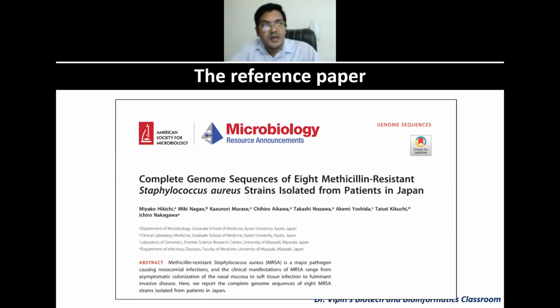All of you need to create an account in usegalaxy.org for the analysis. Probably the first thing that we can do is to upload the data at least today, because when you show the analysis, it is not possible to show it real time because it takes time. So I'll do my analysis and show you the PowerPoint slides of that analysis, and you can follow it up later with your own systems, right?